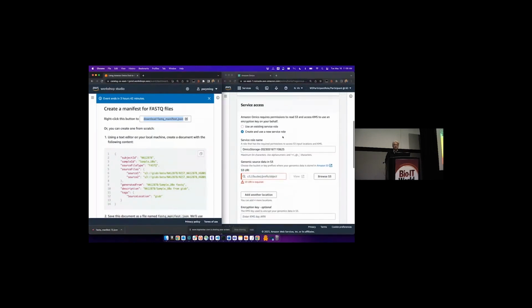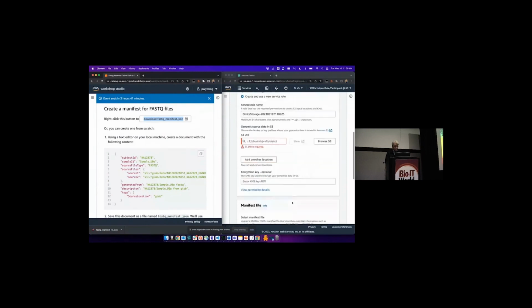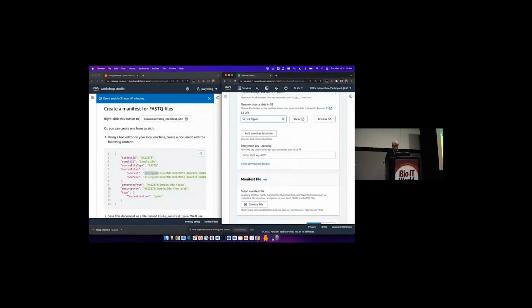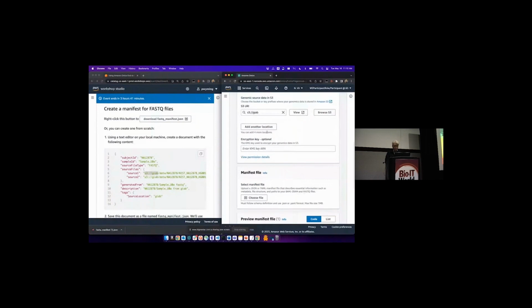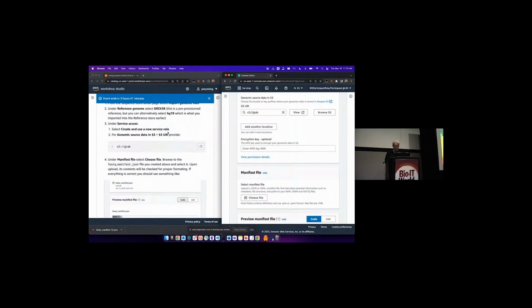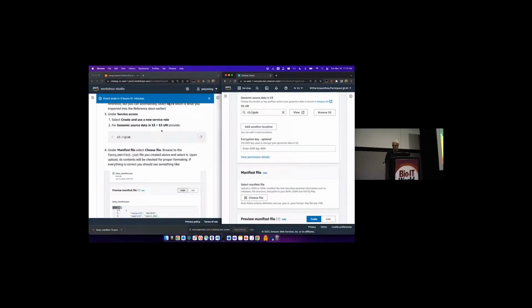So this is for the import. It's asking me for an S3 URI. Yeah, you can just pick the one that gets auto-created. Oh, this is for the service role access. Okay. What you can do is probably copy. We'll just do that. That's right, I forgot. I'm not reading my own instructions, sorry.